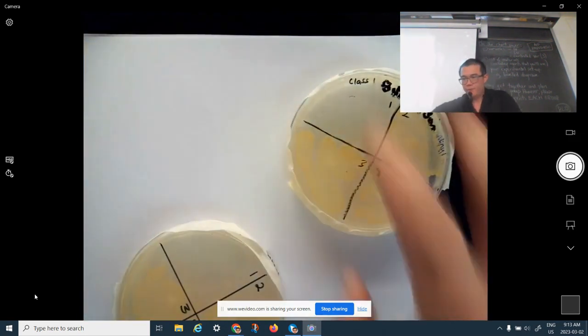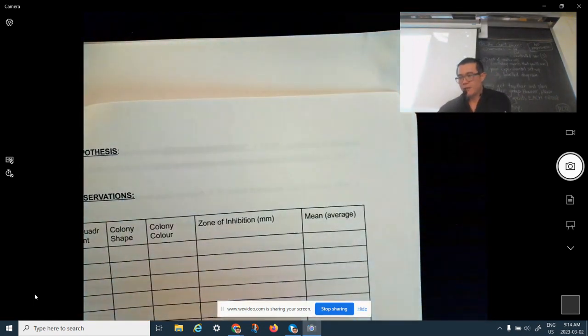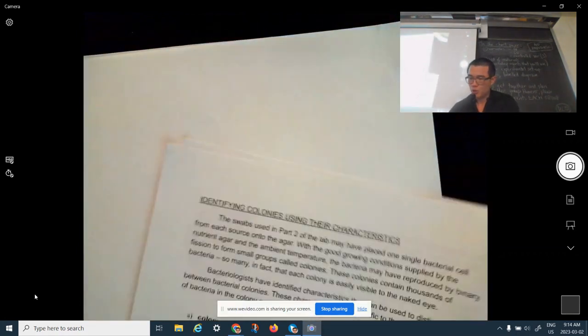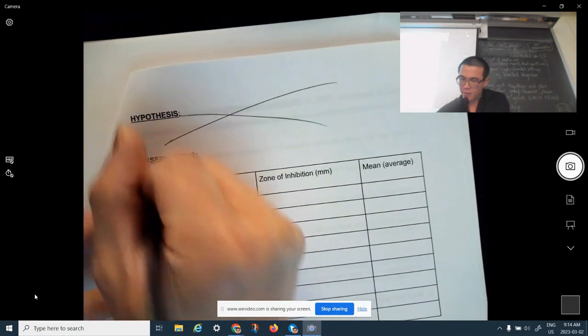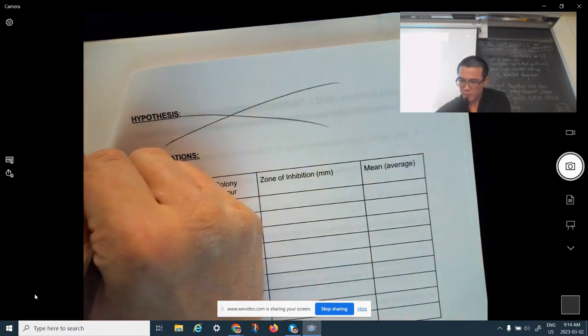Now, first off, for this lab here, you don't need to come up with any hypotheses, okay? This is only for part 2, okay? So for here, this is only part 2. So you're just doing part 2 observation.